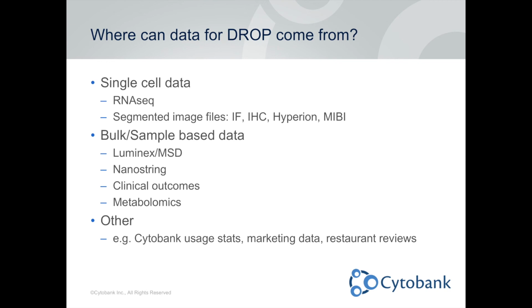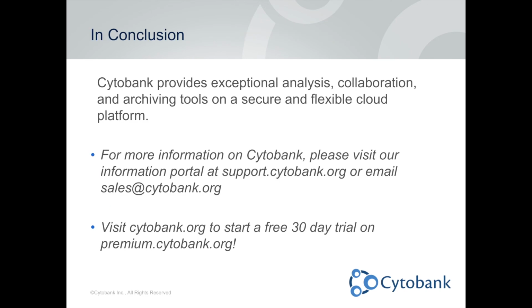But you can get even more creative and upload things like usage stats or marketing data, restaurant reviews, and run Visney on things like that. So again, its purpose is for biomedical data, but please feel free to tinker. It can be pretty fun to see what groups with other things from all other kinds of data. So in conclusion, Cytobank provides exceptional analysis, collaboration, and archiving tools on a secure and flexible cloud platform.